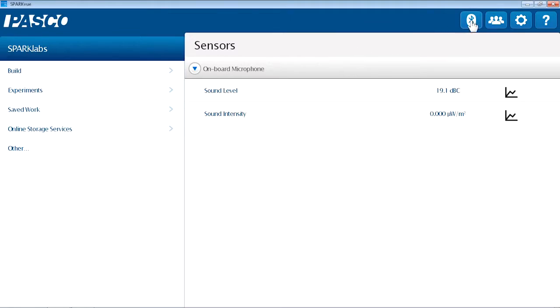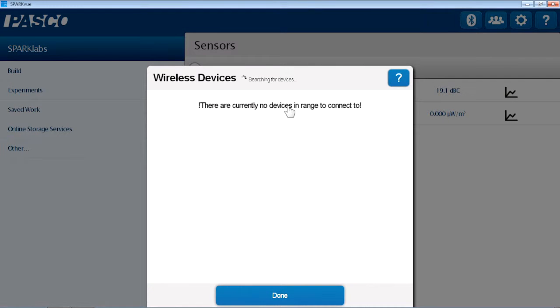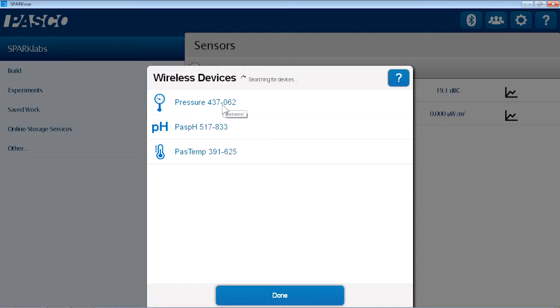So in my software, I can touch the Bluetooth icon. And I will see which devices are broadcasting that signal. And I can see based on measurement, through using these icons, that there's a pressure, a temperature, and a pH. And if I have a class set of a particular measurement, I can identify them based on their unique ID number.